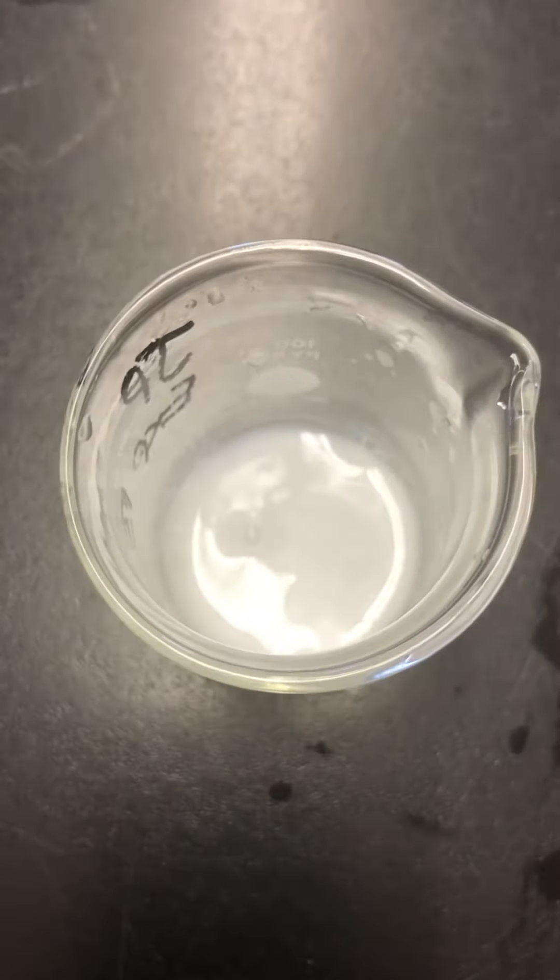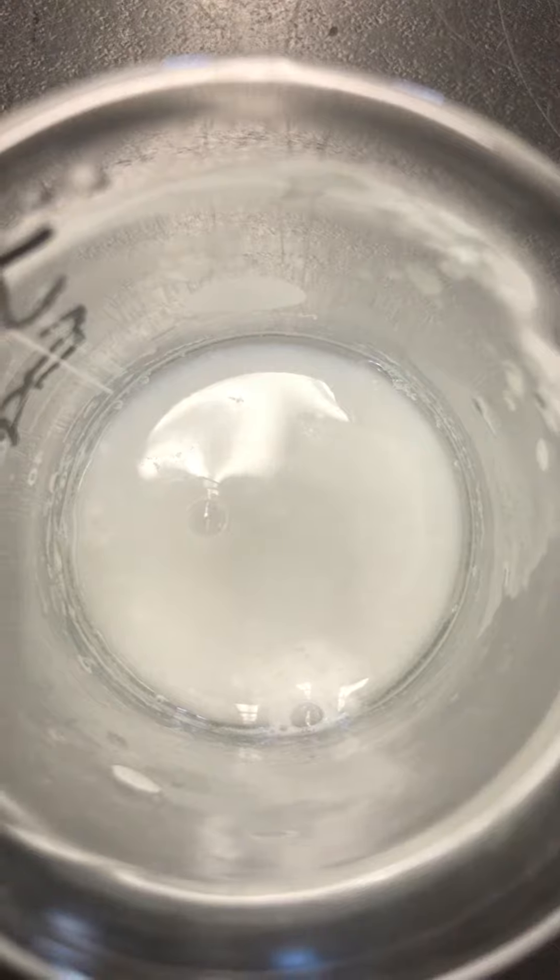So this is your final for solid five with water. And this is your final for solid five in acid.